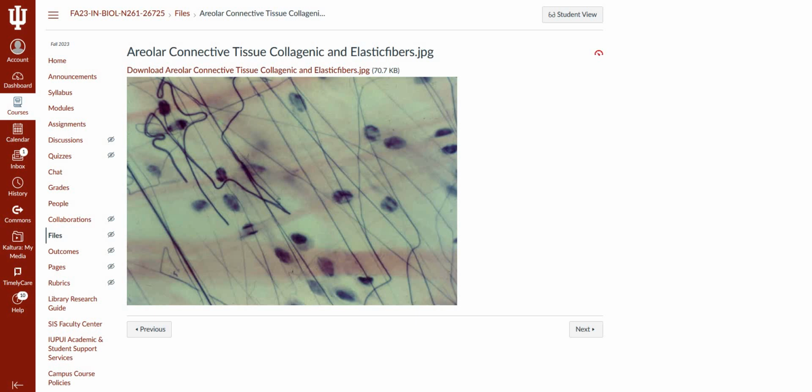Okay, so we have just a couple types of loose connective tissue. This type here is areolar connective tissue. So I guess one memory trick I use for it is I think of air. This is air-like because there's a lot of gaps between the tissue, so you could use that to help you. If you want to use an acronym for this, loose areolar connective tissue can be abbreviated to LACT. So acronyms are accepted on the lab exam.